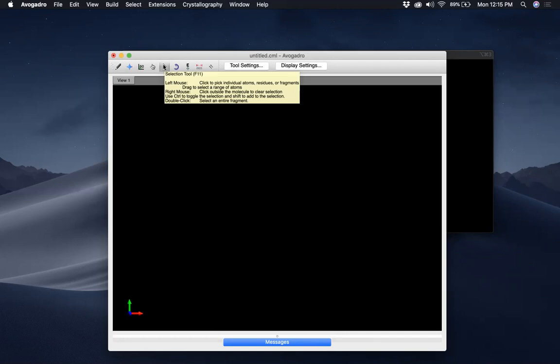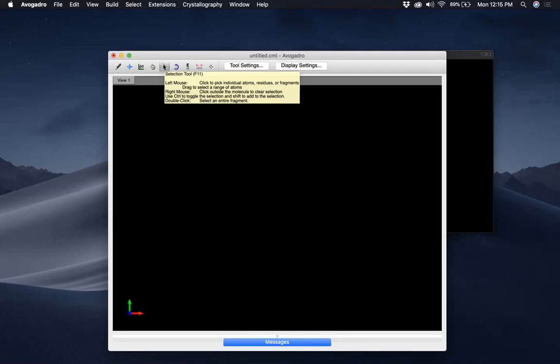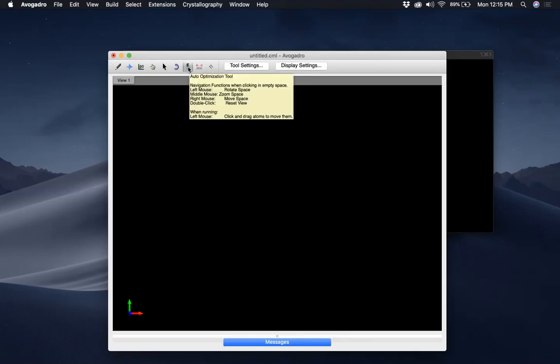Or you can select atoms and then do something only to that section — like you can fix those atoms or optimize them. So you can do something very specific to a section of atoms that you pick. This one is the Auto Rotation Tool; there isn't anything very specific to that.